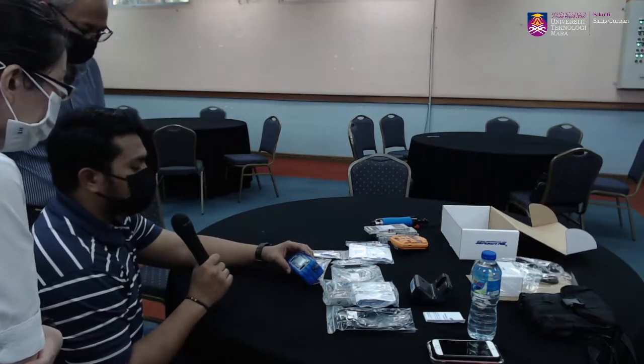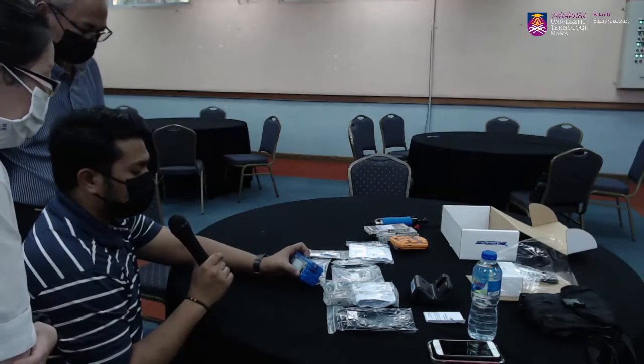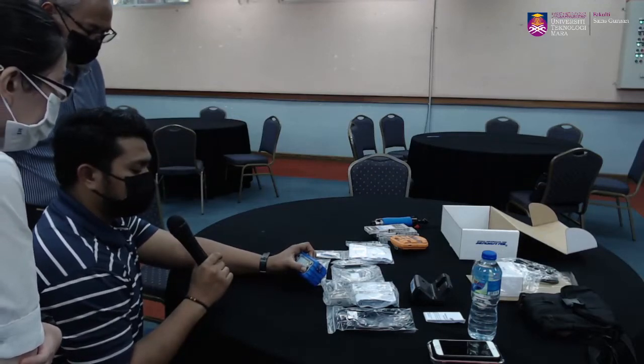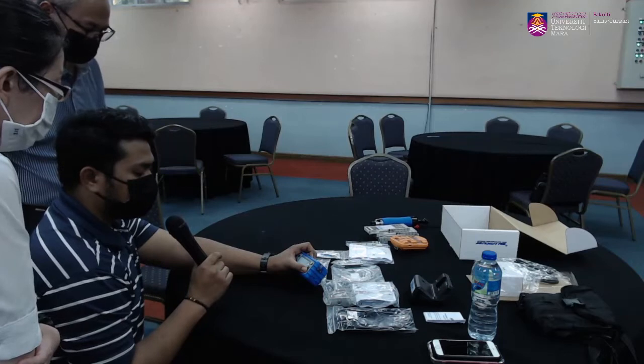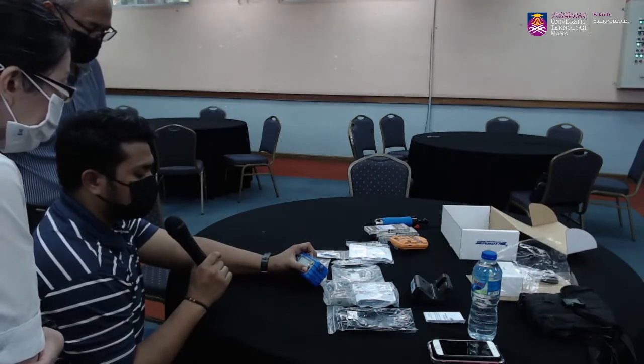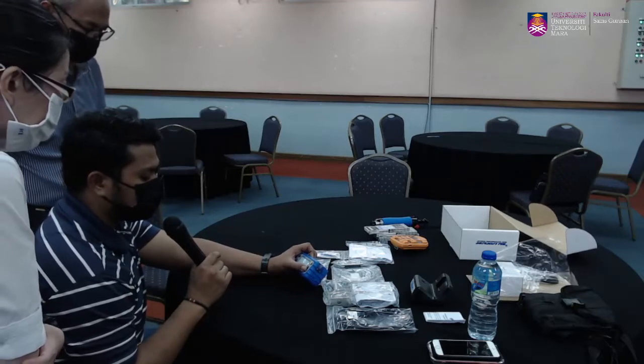Okay. So kalau contohnya kita nak adjust the flow rate tu, kita just plus minus. So nanti dia akan tukar. So kita just boleh tekan lama-lama untuk dia tukarkan kepada flow rate yang kita nak lah. Contohnya 1 liter per minute, means that 1000 cc. Kita just tekan sampai dia 1000.